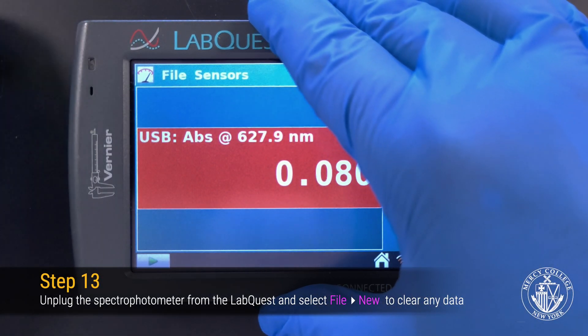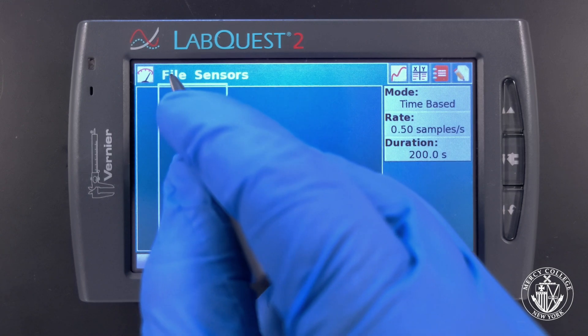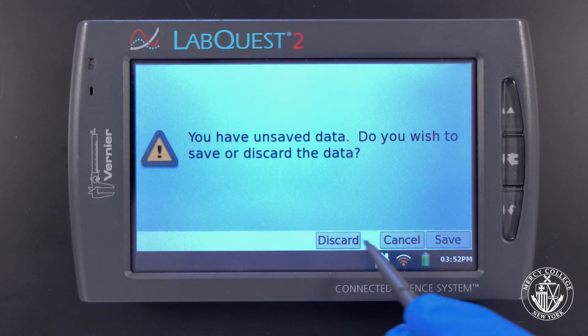After you're finished analyzing all of your samples, disconnect the spectrophotometer cable from the LabQuest. Select File, New, and discard any existing data.